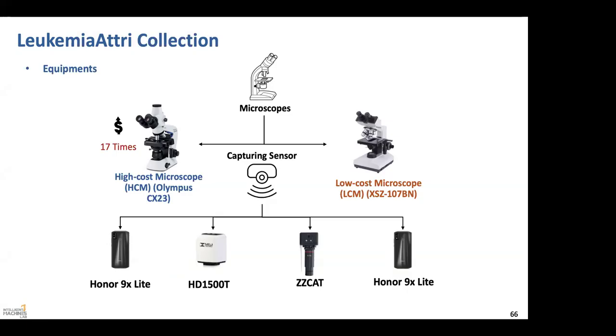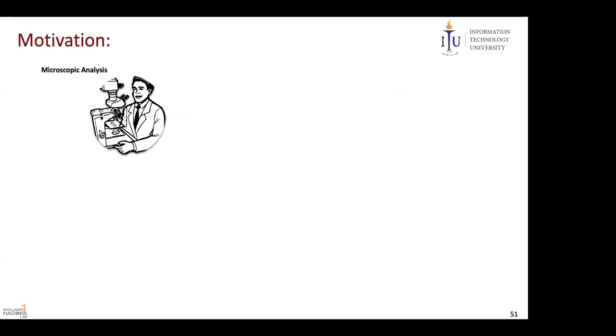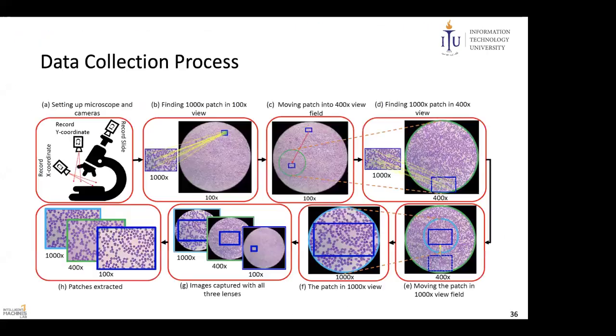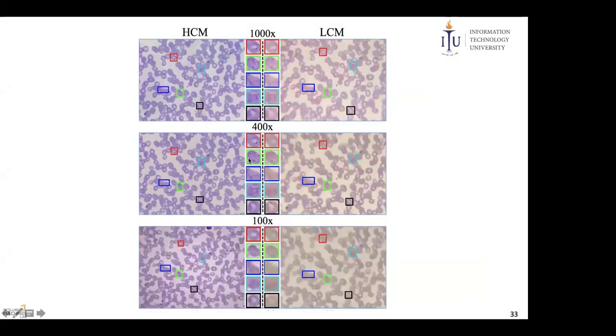Waqas, I had a question. You have high and low zoom images, right? So there should be a scaling difference, but you have one-to-one correspondence. Do you scale up or down? I mean, do you resample the image? Can you please repeat the question? Let me show you the image. So maybe in high zoom, one patch shows like 1 mm by 1 mm, but in low zoom, that patch would look much smaller, or the same size area would cover a larger actual area.